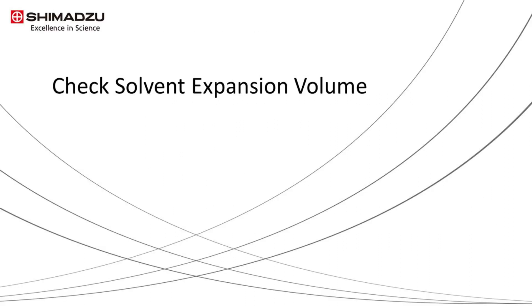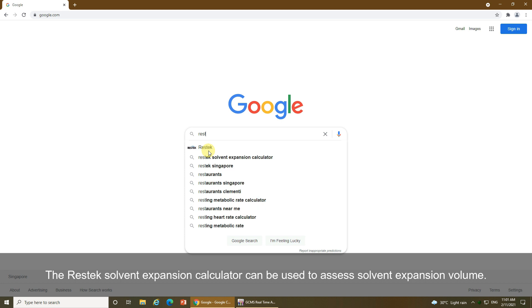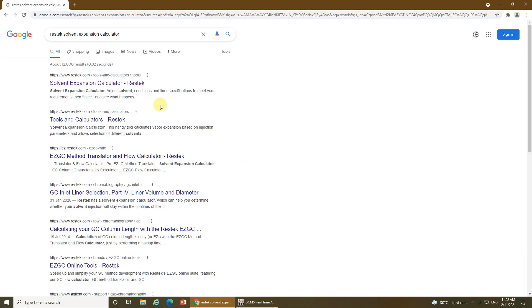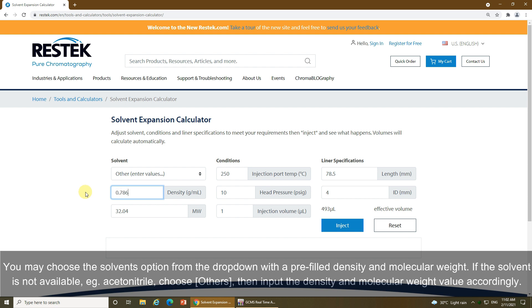Before we create the method, we must check the solvent expansion volume of the solvent used to determine the pressure required. The Restek solvent expansion calculator can be used to assess the solvent expansion volume. You may choose a solvent from the drop-down options with pre-filled density and molecular weight. If the solvent used is not available — for example, acetonitrile — choose 'Others' in the drop-down, then input the density and molecular weight values accordingly.